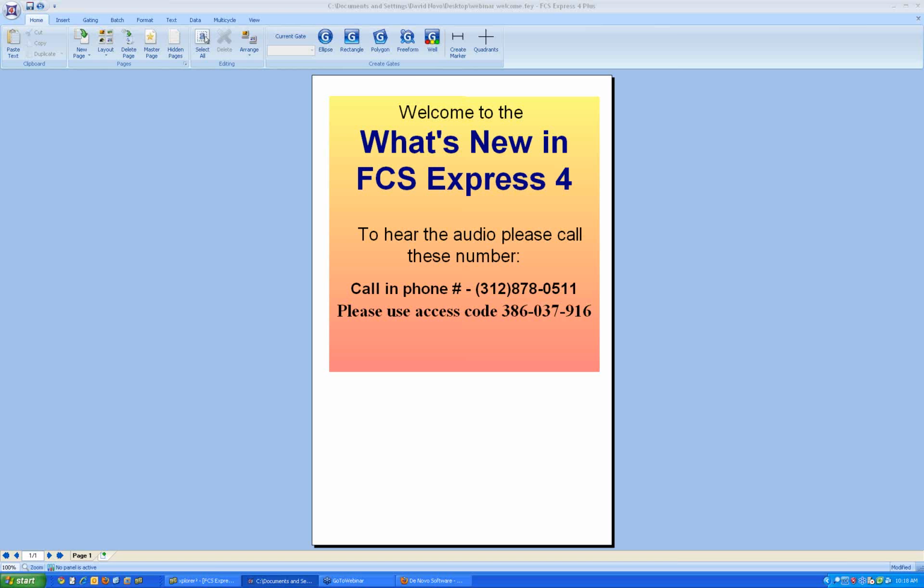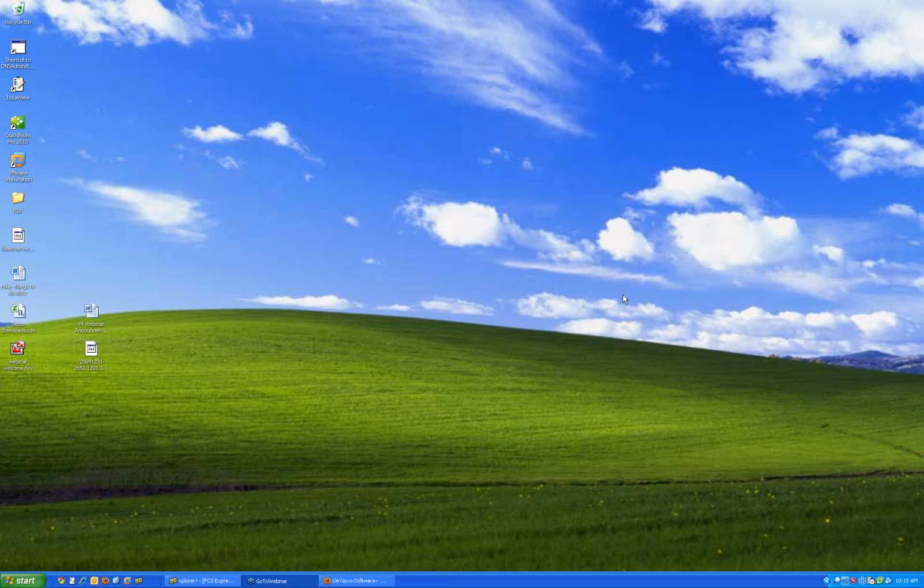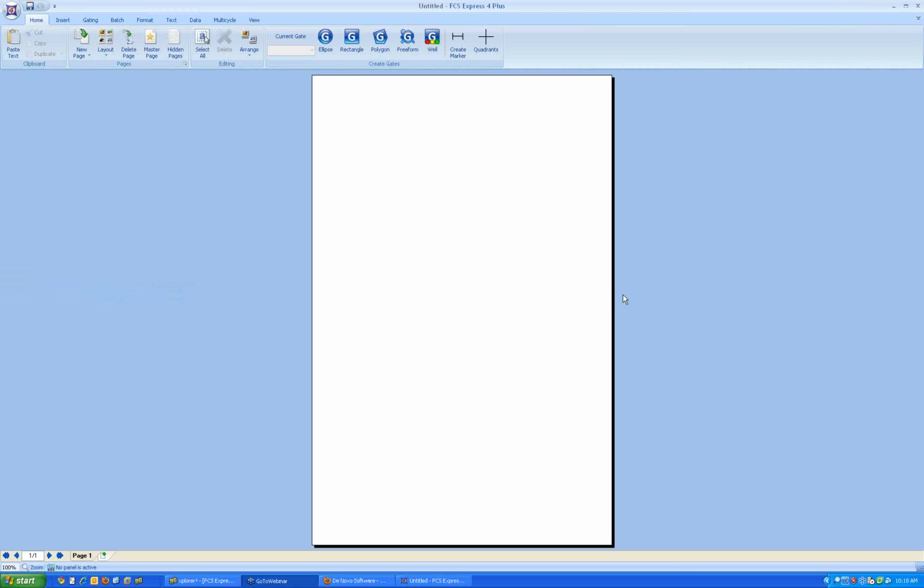Okay, so first thing before we begin is what is blatantly obvious. The software has a brand new user interface. That's the so-called ribbon interface, popularized by the Microsoft 2007-2010 software packages, Office packages. Basically, instead of having drop-down menus like before, the menus are organized on this ribbon. So you still have a topmost selection at the top, but instead of things dropping down, they're dropped across.